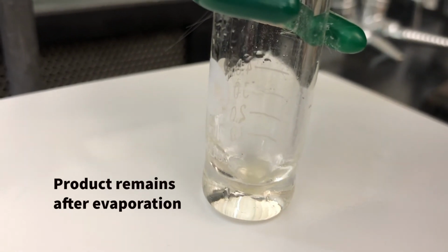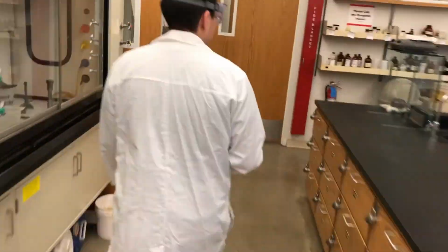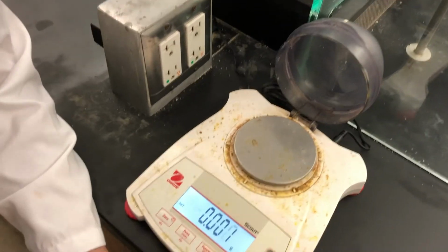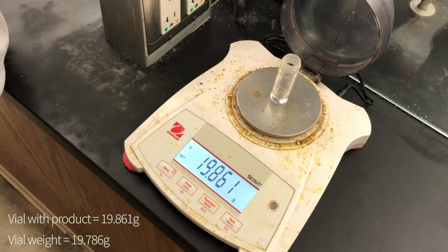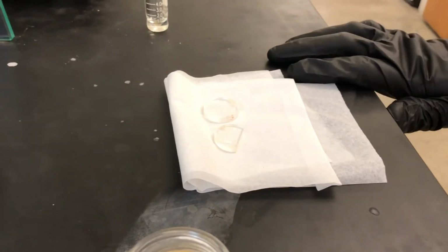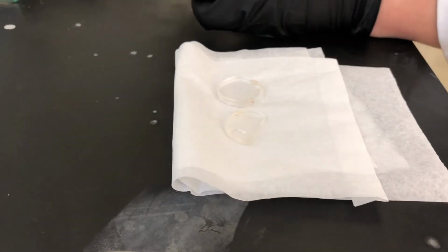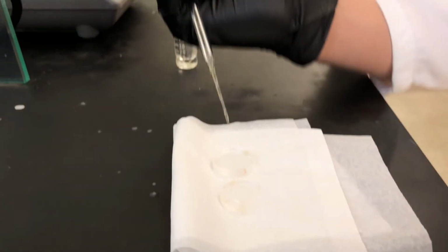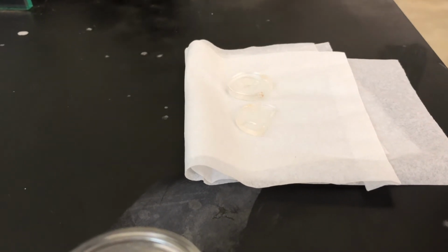Okay, now we're going to go weigh it. So it's 19.861. So here we have two salt plates. We're going to do a neat IR since we have a liquid product. I'm just going to put about a drop of our product onto one of the salt plates, like that, and then we're going to run it through the IR machine.